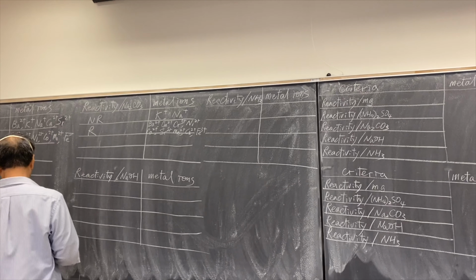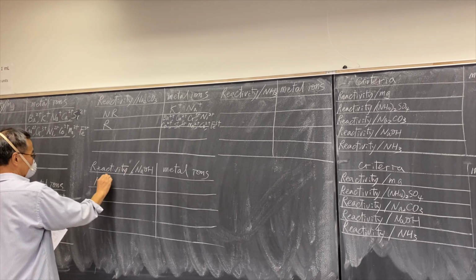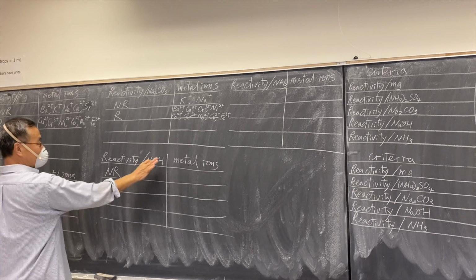And then the next following one is also reactivity with our sodium hydroxide.